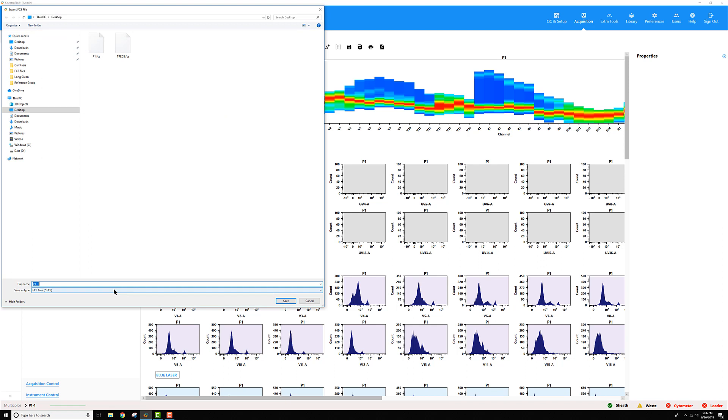Give it a name. I'm going to call it Merged File Test and save it to my desktop. Click Save.